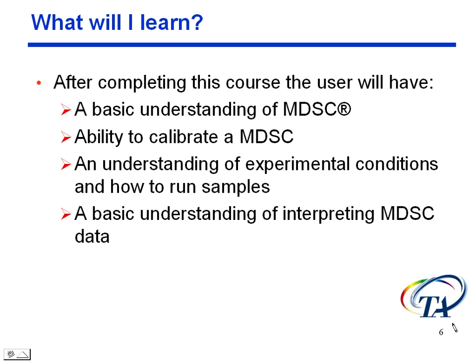After completing this course, you're going to have a basic understanding of modulated DSC. You're going to have the ability to calibrate your modulated DSC, an understanding of how experimental conditions affect your data, how to run samples correctly and get the best results out of them, and a basic understanding of interpreting the modulated DSC data.